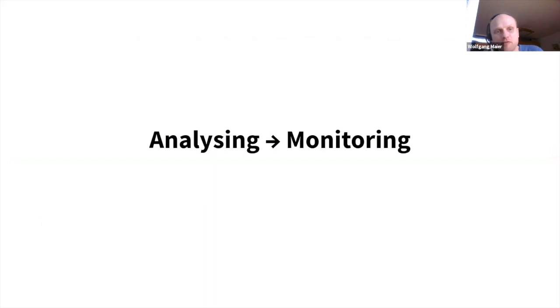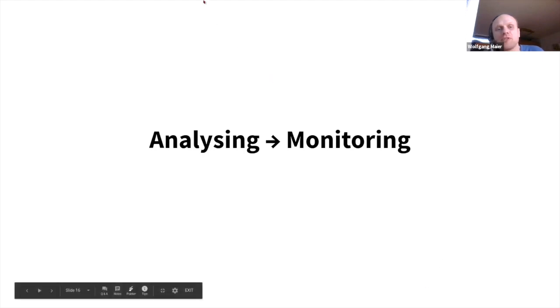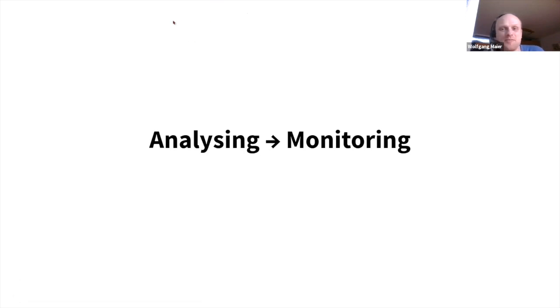So we have these analysis capabilities, which can be used for monitoring what's going on with COVID-19 evolution and variant emergence. And the question is really how to share this with the community. And this is where Babita and Beacon come into play.